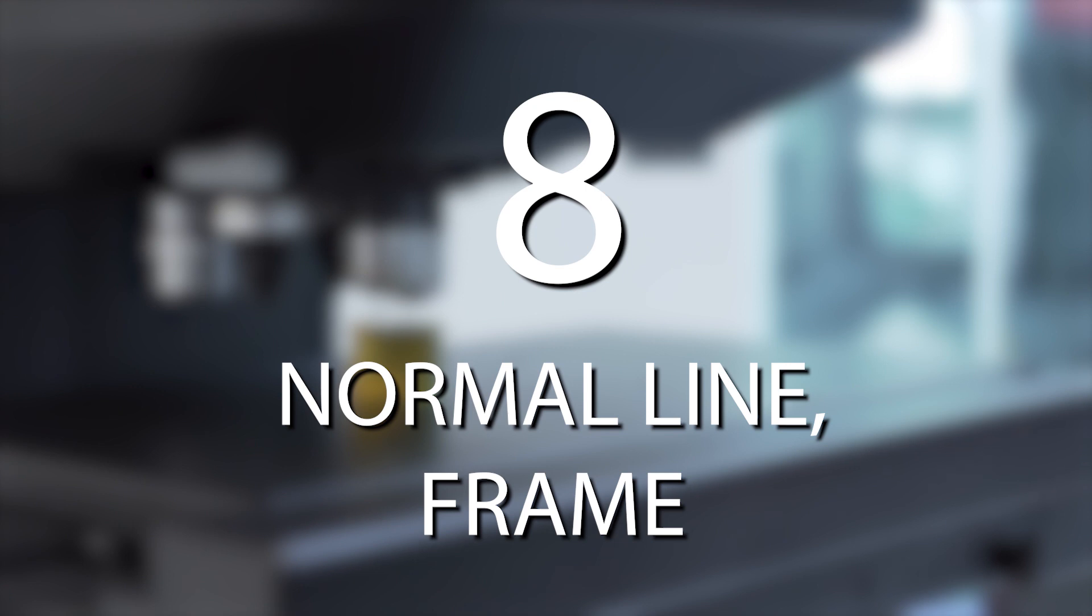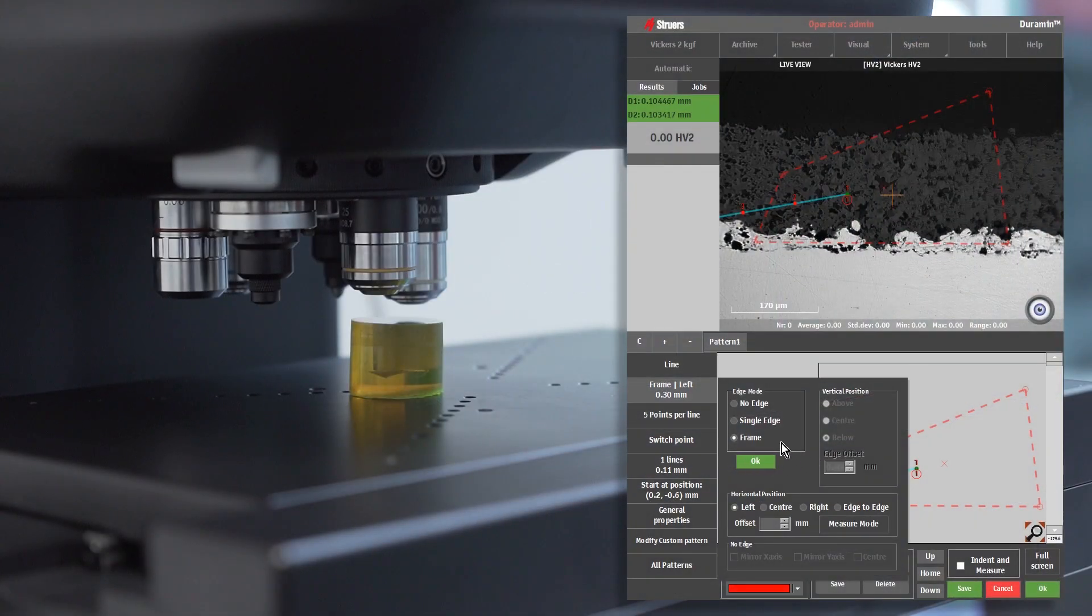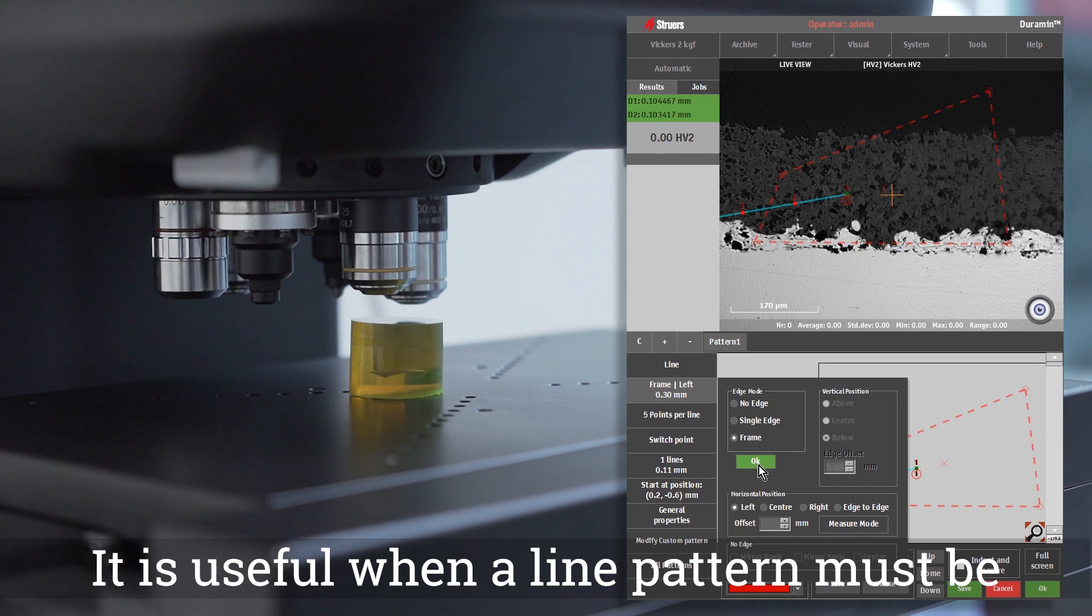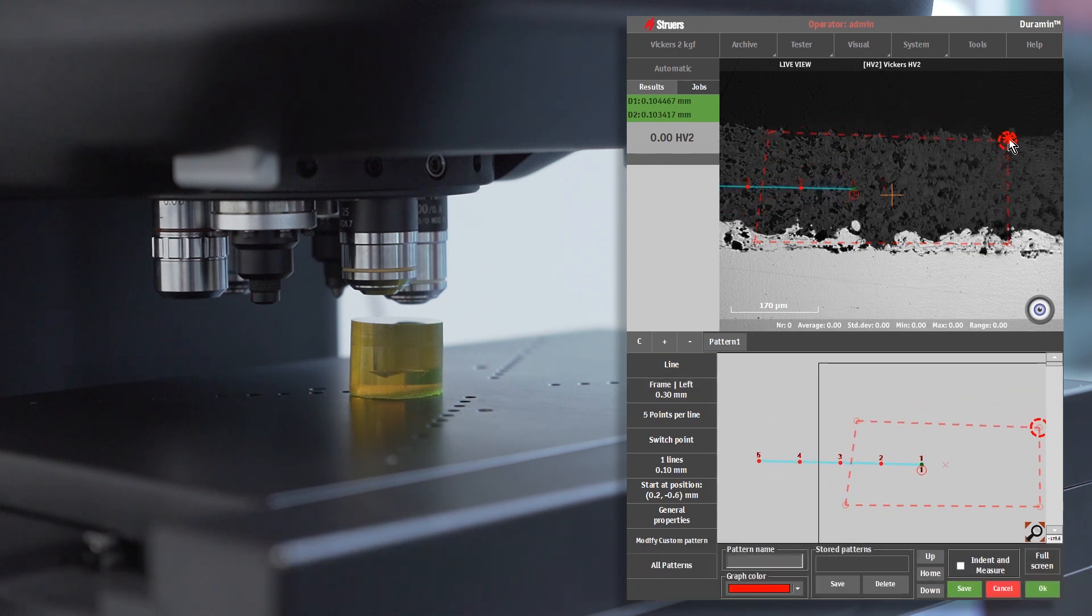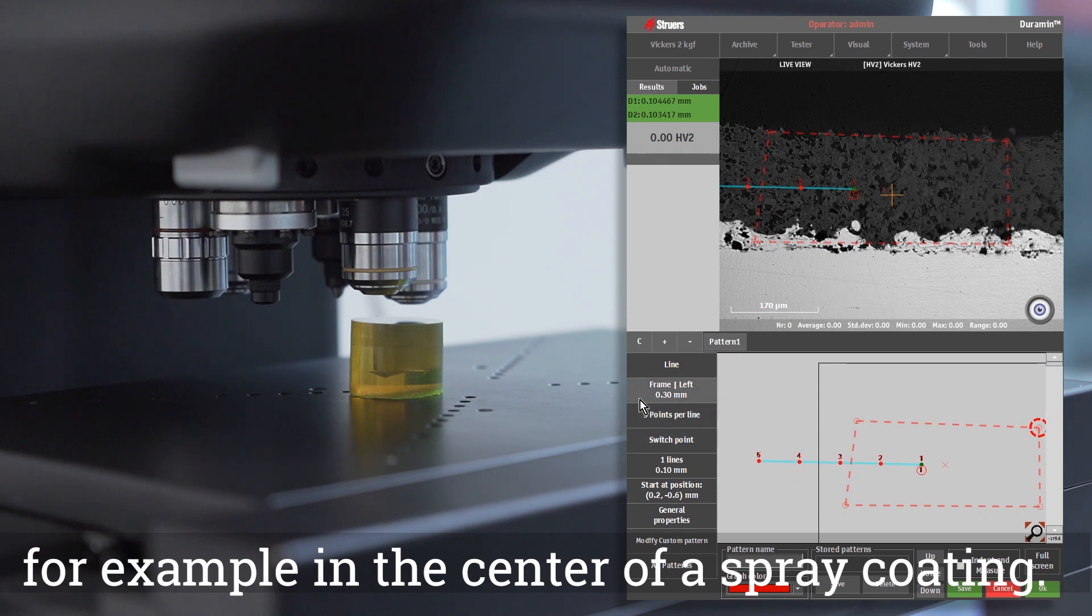Normal Line Frame. It is useful when a line pattern must be evenly distributed between two edges, for example in the center of a spray coating.